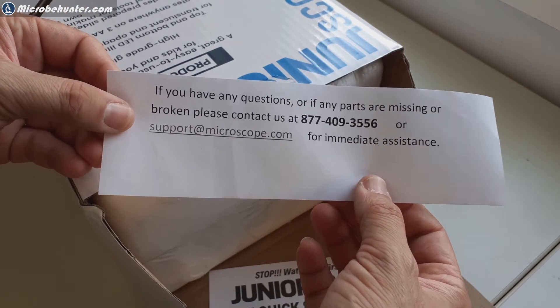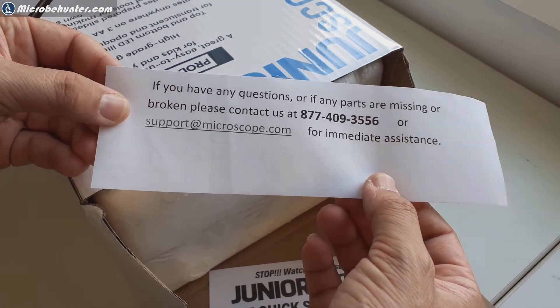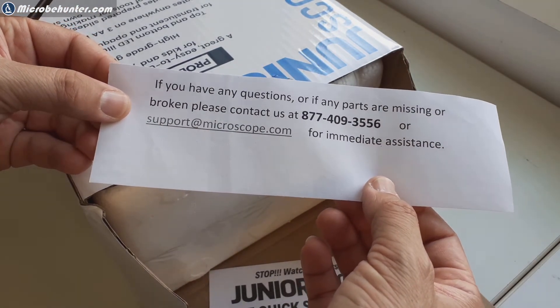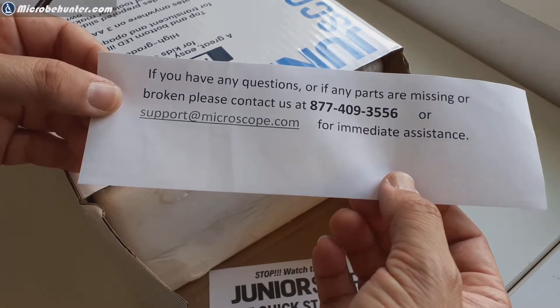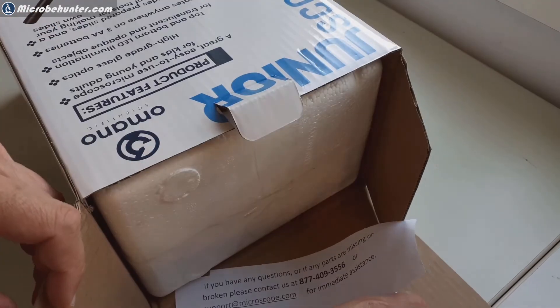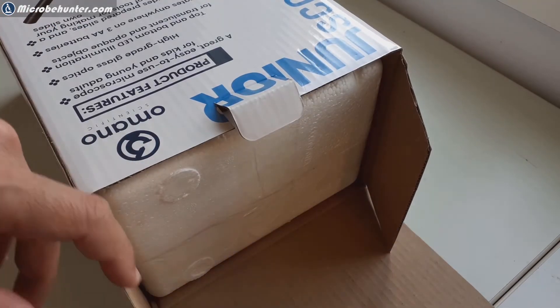And of course also an email and a telephone number to contact the company if you need any help. I think that's an absolutely great idea and I've not seen this done before in any other microscope.